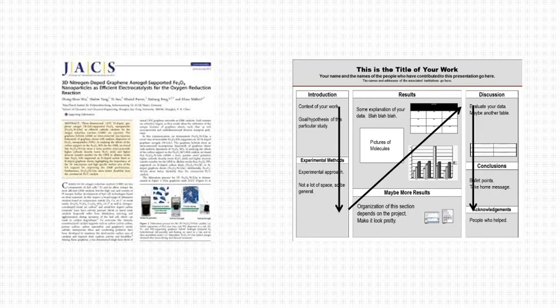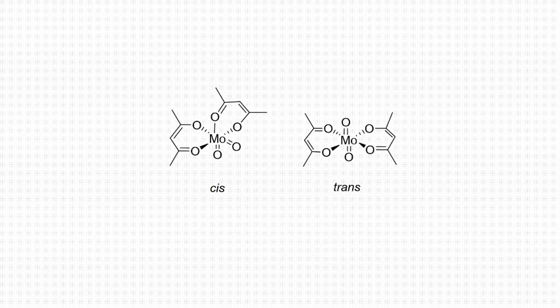A last comment is about safety related to these compounds. When you're synthesizing these things, again, I want you to wear your eye protection and your gloves. There aren't a whole lot of hazards. The main issue is that we'll be working with a relatively concentrated base solution, ammonium hydroxide, and a concentrated acid solution, nitric acid. In both cases, you want to avoid getting those on your skin or splashing them on your face. Otherwise, those are the main hazards here.